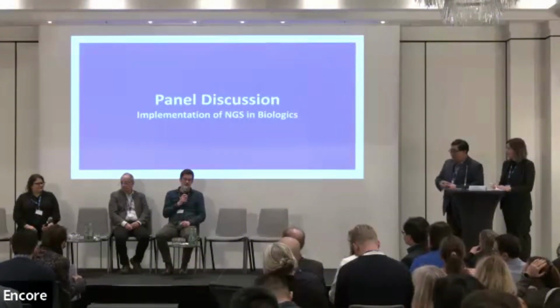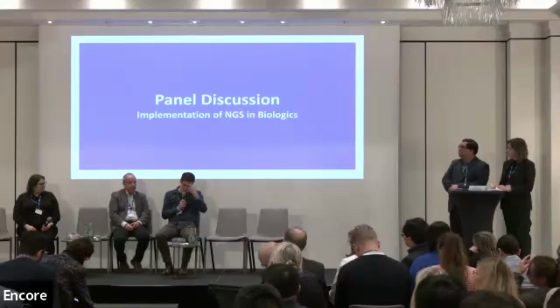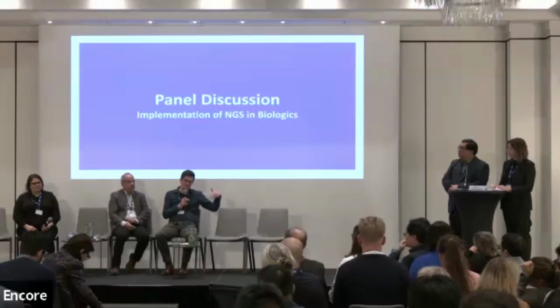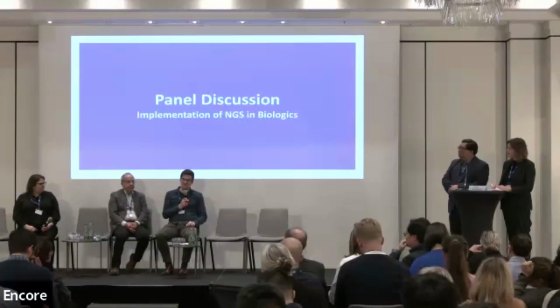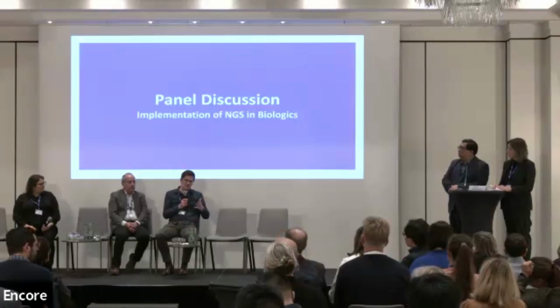Yes. Oh, okay. Yeah, so that's what I was saying earlier, right? Indeed, if something doesn't hit the viral database, it would not go into the qualification step. Like I said, we always have some unclassified data. That's true currently, as well as with this pipeline. But it's a very low number of reads so far. I don't really have a number, like if all of a sudden we had 0.01% unclassified, that would be an alarm, maybe. I don't know what number that would be.